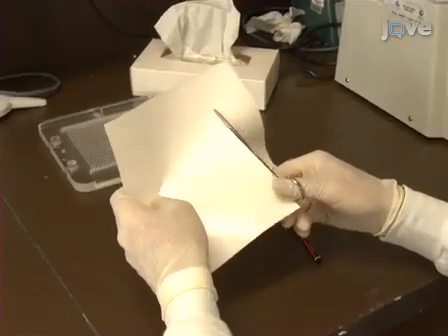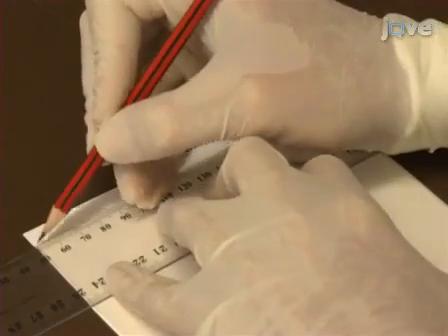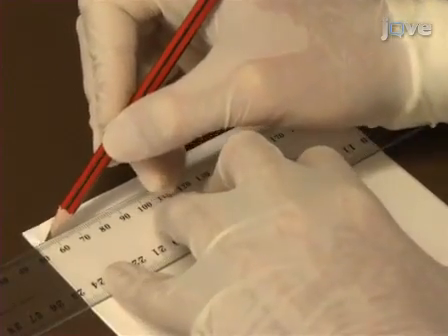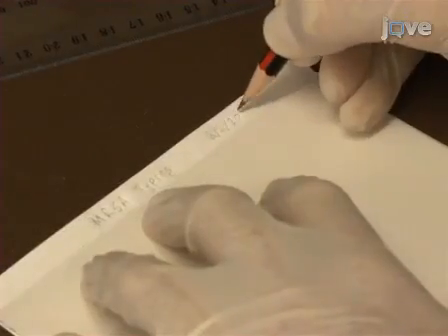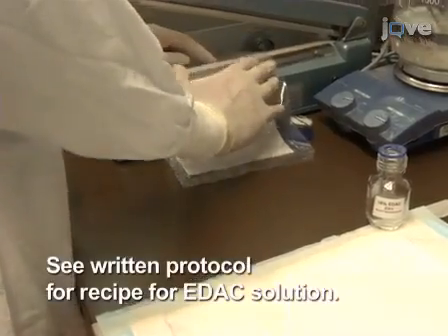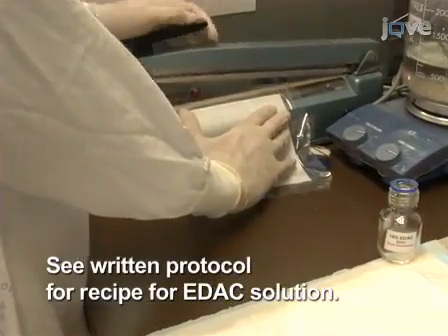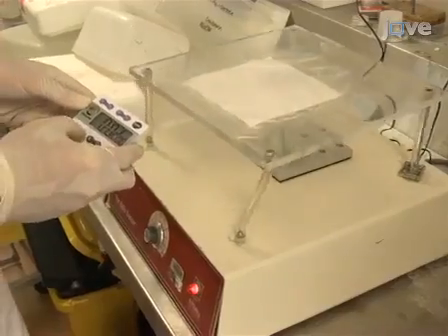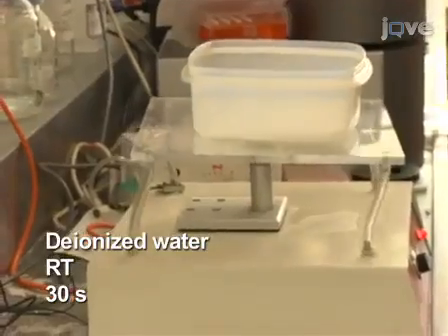Cut the nylon membrane to 15 by 15 centimetres. Using a pencil and ruler, mark off a 0.5 centimetre space across the top of the membrane and write the details of the experiment there. Seal the membrane in a plastic bag with 20 millilitres of freshly made 16% EDAC solution and rock at room temperature for 10 minutes. Wash the membrane in deionised water for 30 seconds.